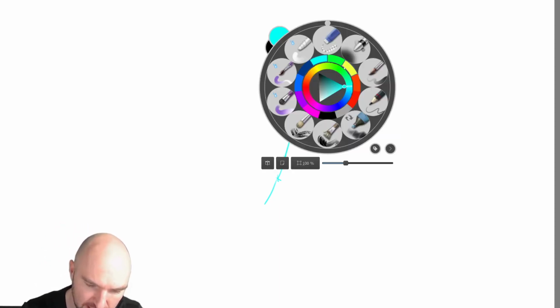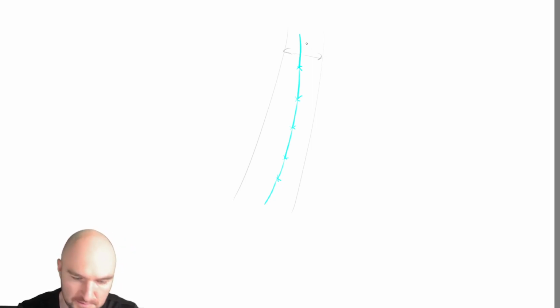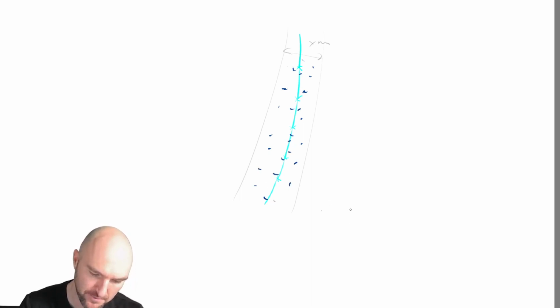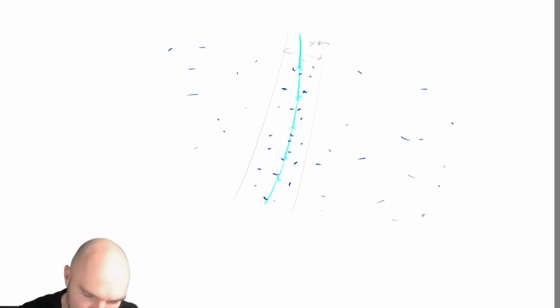Okay, so we've got our interface, essentially with the whole limit of this being x nanometers thick. And then we have our boron atoms that sit around here, and you have some boron atoms that are away from the surface. What we have done is essentially calculate a background concentration. So we've looked at how many atoms we have here compared to here. So we've created a Z0.